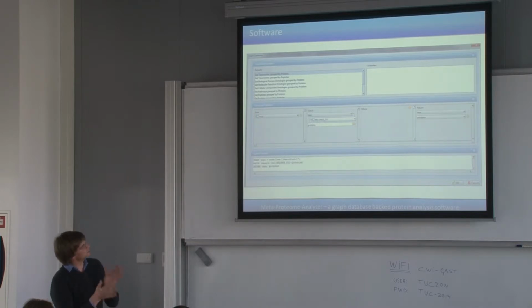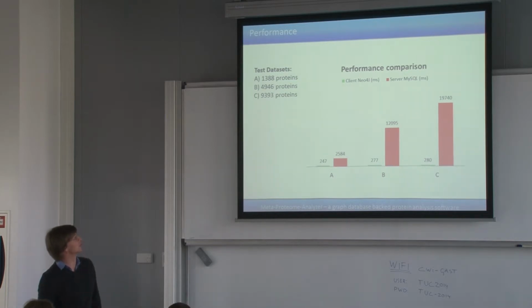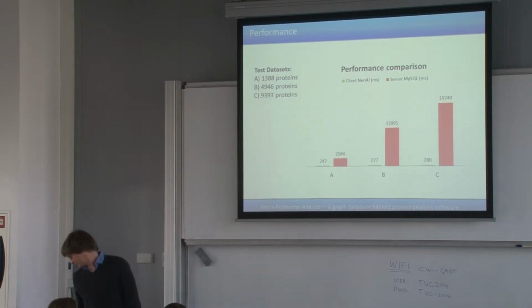Well, it's not as easy as he could just ask the question directly, of course, to an informatics guy, and he will find it out. But with this composition, I think our lab users are trying to fit it in. So that's what it's looking like in the software, and just performance. I'm not a benchmarking guy at all, so I just took some really small data sets here, and what you can see, if you query the same data set against a server, which we have as a machine in-house, is that Neo4j is scaling quite nicely, I think, on the different data sets.